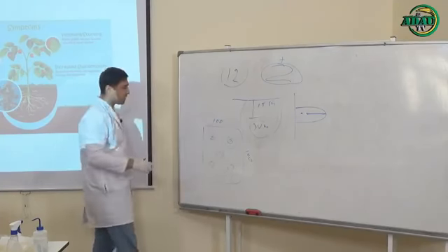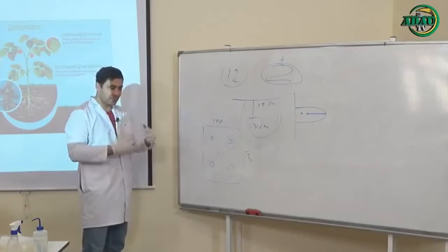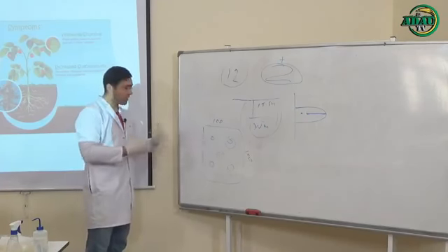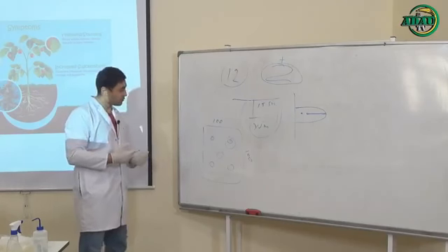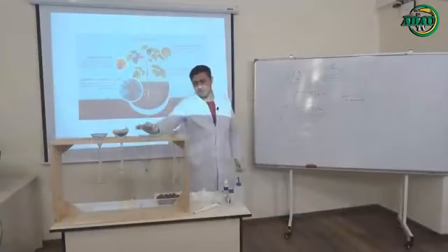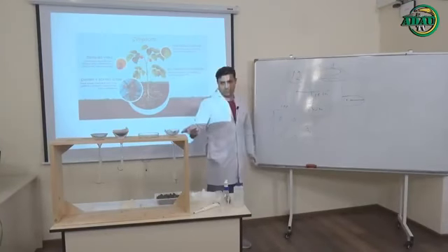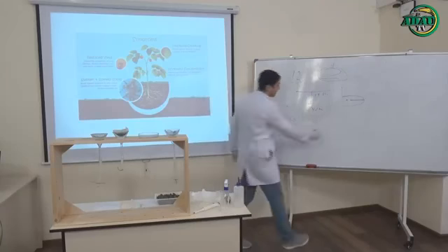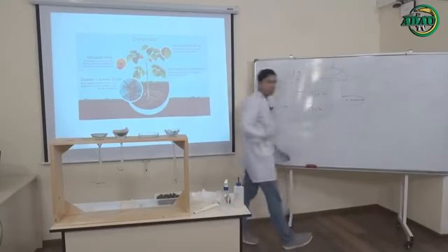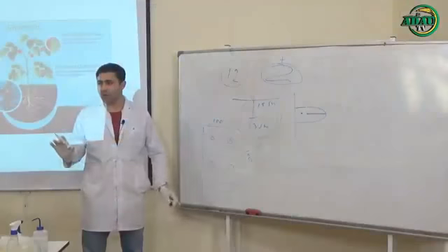At the same time, you can take all soil samples and mix them together. After that, you can put these soils inside a funnel, but not only one funnel. You can do many and search for nematodes. Without this, you cannot be sure there are pathogen nematodes for our plants.